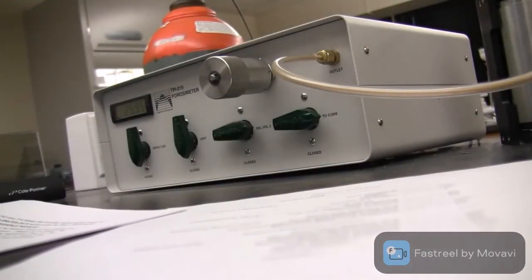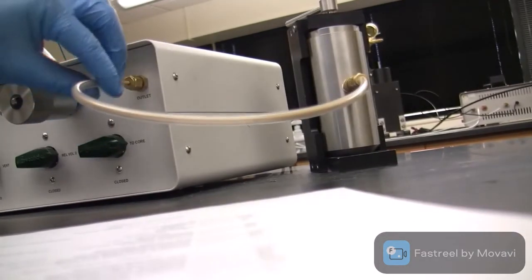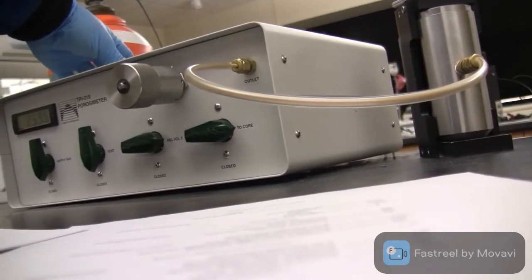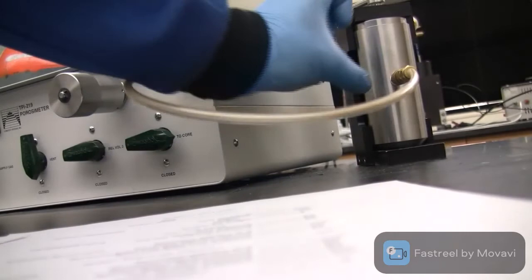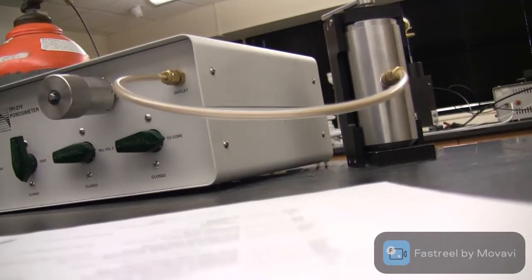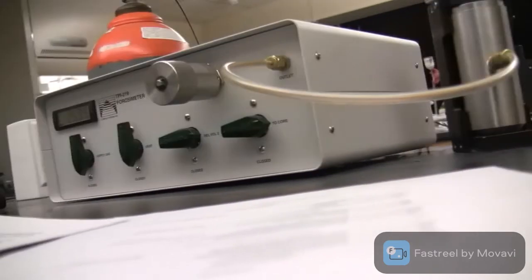So now we have finished the second part of the experiment, where we do get the reference volume for my experiment. Now I know the volume inside, the additional volume inside this chamber, along with the connection into the first chamber, along with the volume inside the first chamber. So what remains is put my core in here and repeat the steps. In this way we will be able to get our grain volume. How do we do that?